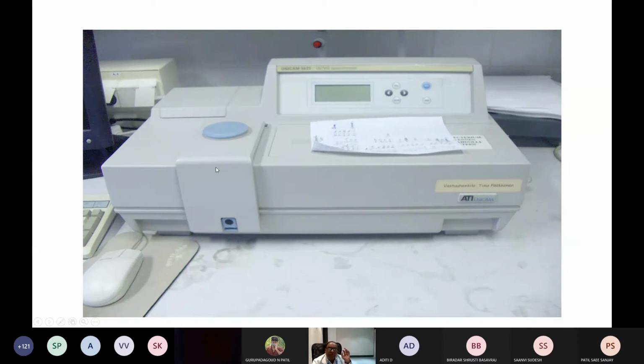The advantage here is that in some spectrophotometers, even in the semi-auto analyzer or fully auto analyzer, taking into account all these absorbances, it will measure, calculate and display the direct value here. That is quite a common feature in semi-auto and fully auto analyzers.